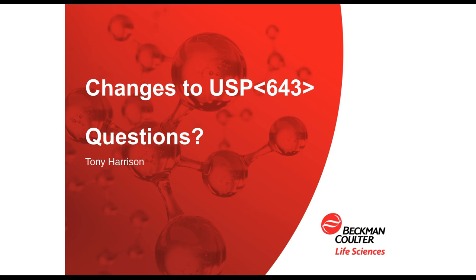Thank you so much. Our next question, please can you explain again why sucrose or benzoquinone were chosen for the System Suitability Test in USP 643? Certainly. So this often confuses. So the TOC test, as I mentioned, was introduced into the United States Pharmacopoeia in 1998, and it actually replaced several other tests. And as I mentioned, the USP committee were concerned to ensure that any TOC instrument used to perform these tests should be capable of successfully oxidizing the range of organic materials to be found in purified water and water for injection.